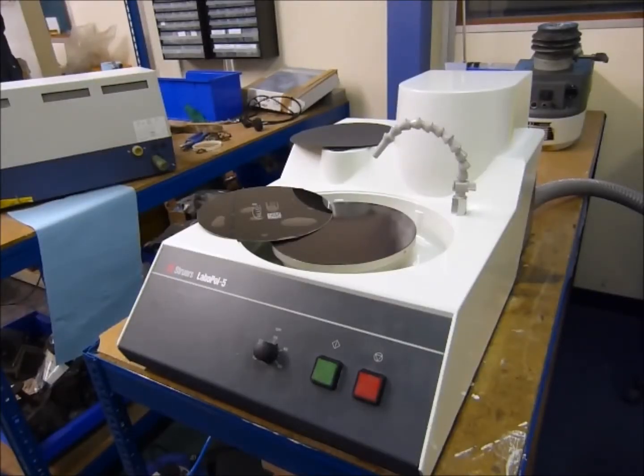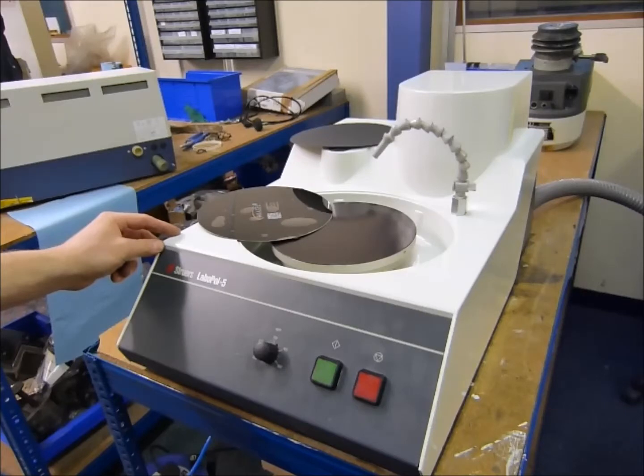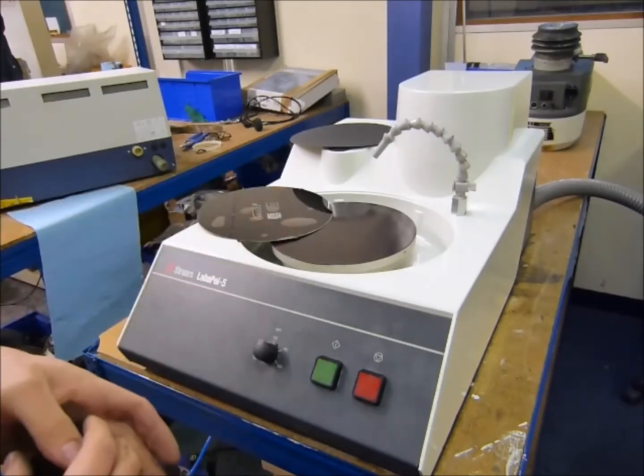This is a quick video demonstration of how to grind using a Struers LaboPol-5 using the Gritfix system.